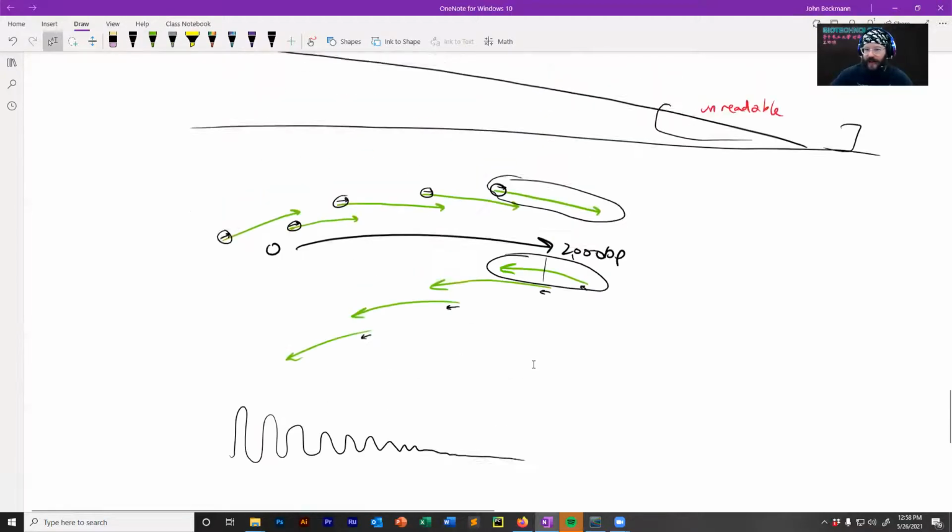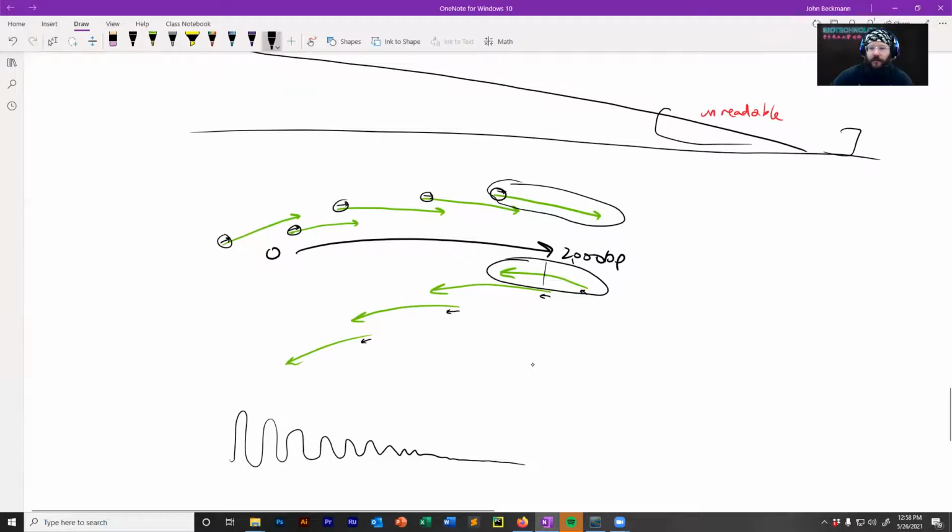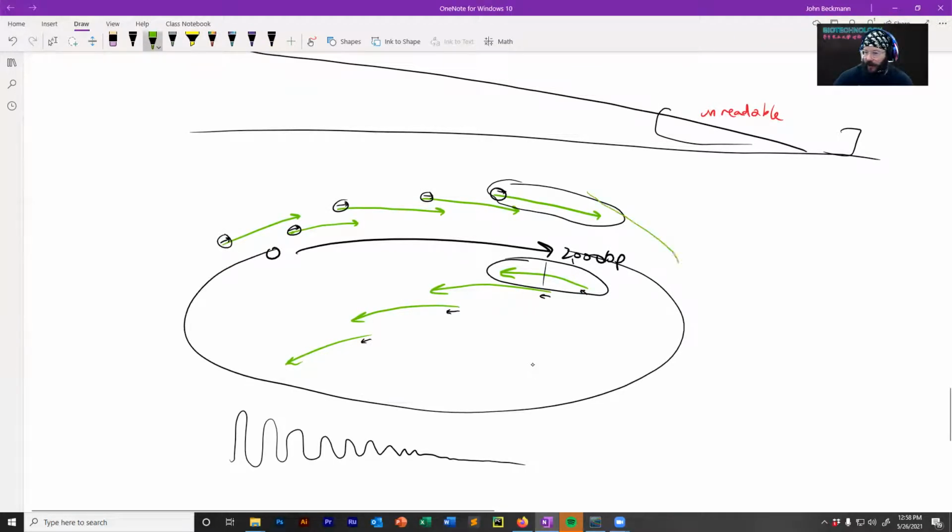If you're sequencing a plasmid, this is circular. And so this read can just keep going and keep going, although the quality is going to get lower and lower and lower.